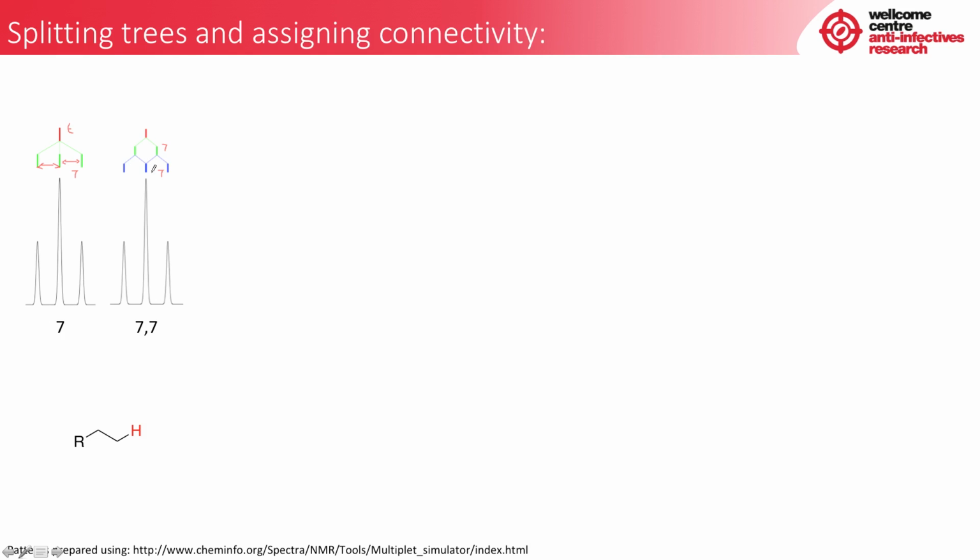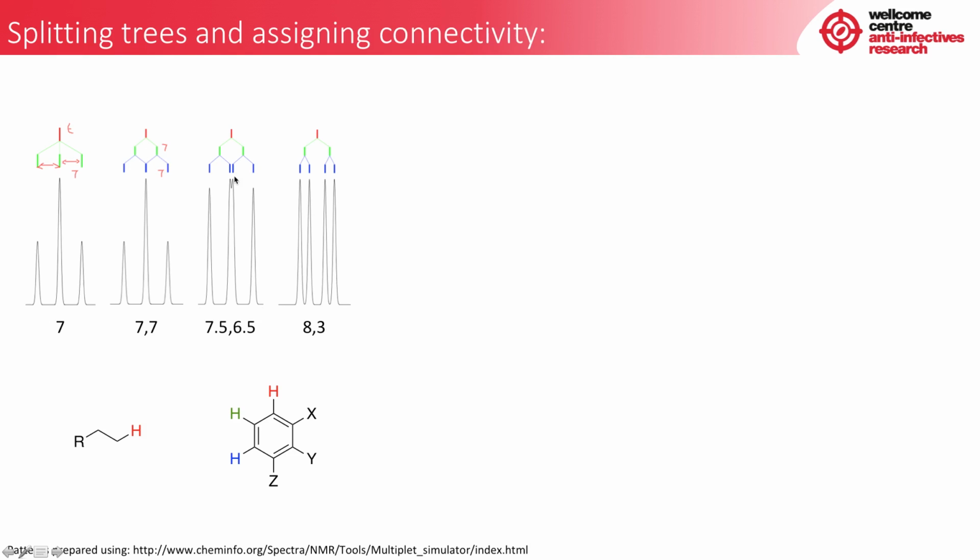To give you an example where the J values are not the same, here we have the central green proton. It has 2 ortho couplings. Here is the small coupling. And if we wanted to find the large doublet here, that would be the center point between these 2 signals that are split from it. However, we don't need to actually measure the center point because that spacing is the same as the spacing here. So we can take these lines, or the equivalent of that signal, and measure this, and that is our second J value, which is 7.5 Hz.